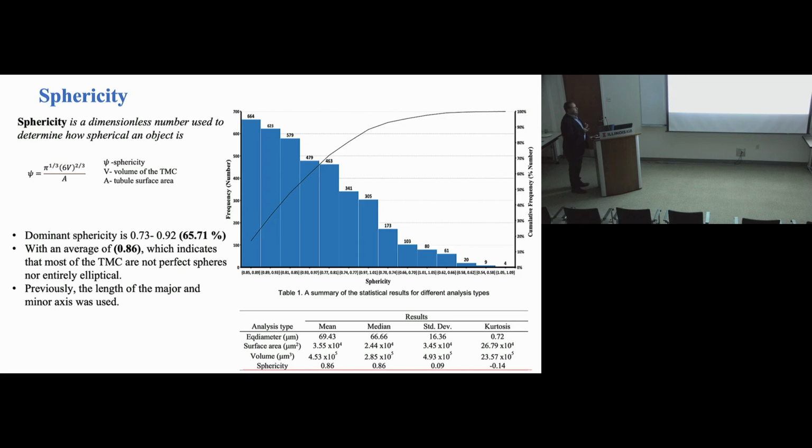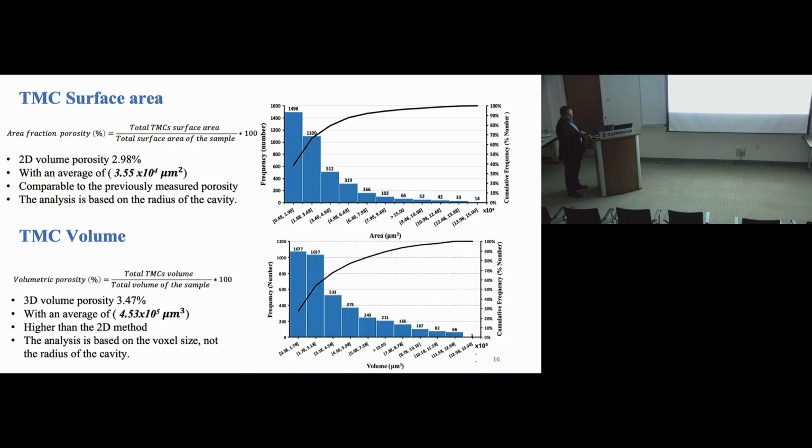And the other thing is, if you look at the variation and the values here, we cannot say that the majority of the hoof has a spherical shape or an elliptical shape, but it's an integration between both of them. One of the things I noticed when I was preparing this presentation is that in all of the previous measurements we have done, we can see a gradient in all of them.